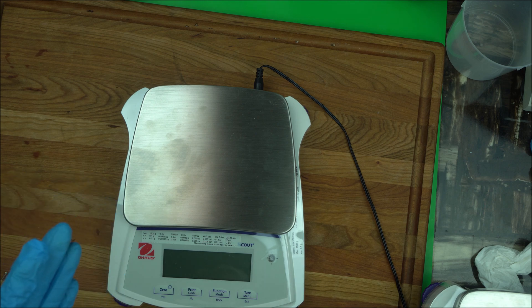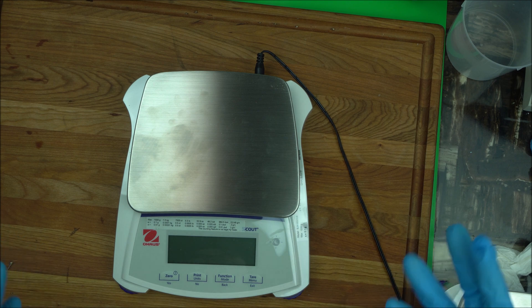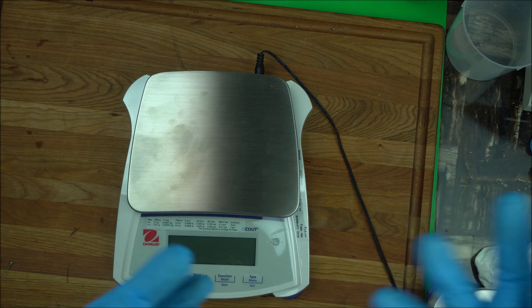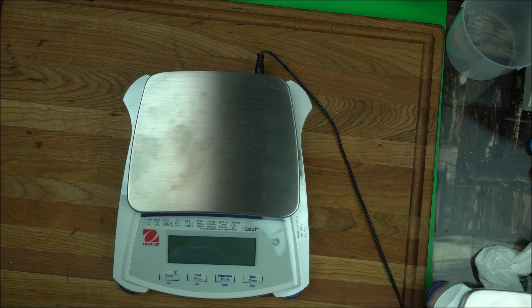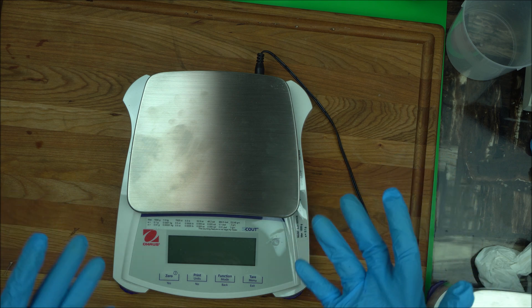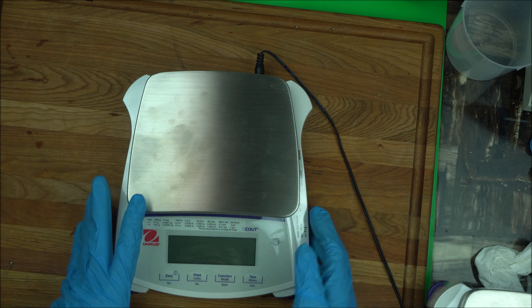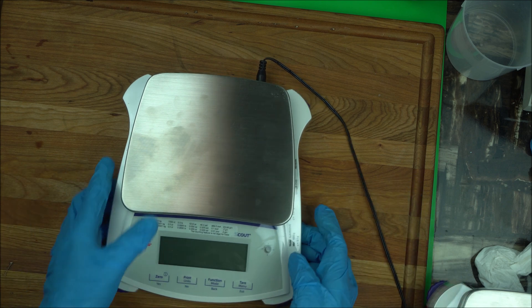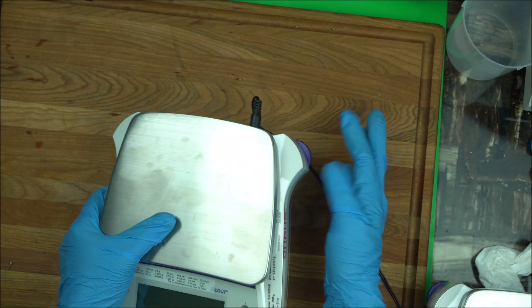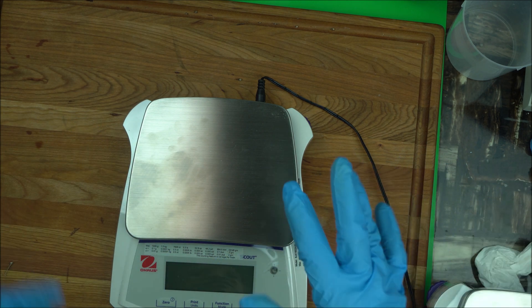Take it from me as someone experienced in this business — I mean I don't mean to be proud, I'm just telling you as an experienced chemist who has been in the workforce for a while. I've told you before that I'm going to show you my lab ingredients one at a time. Here is a scale called the SJX 1502 by Ohaus, and it is a very excellent scale.